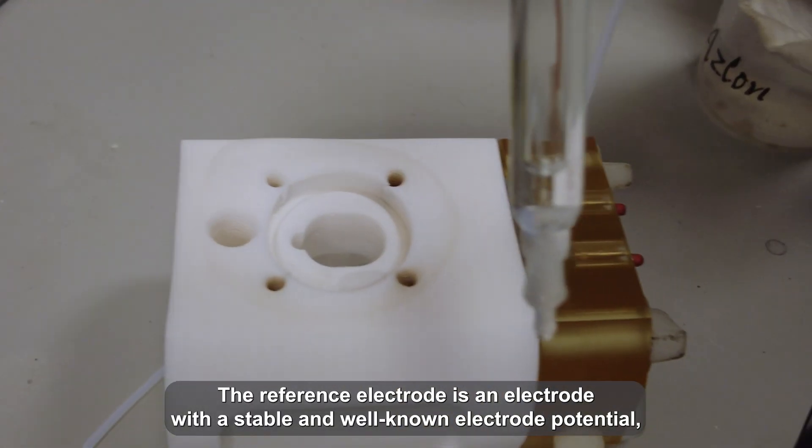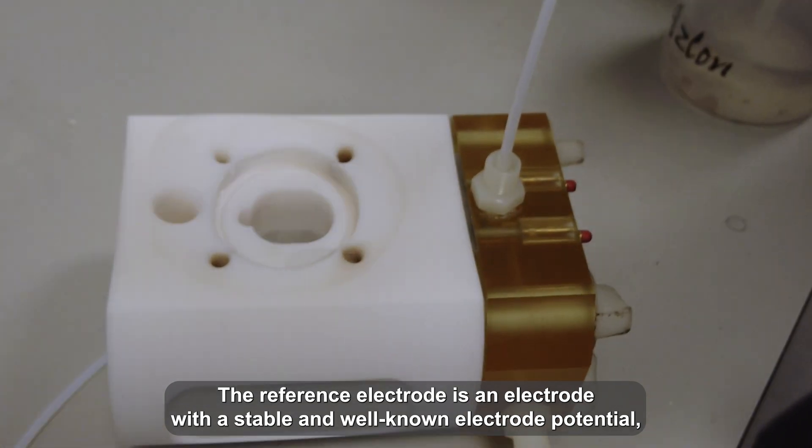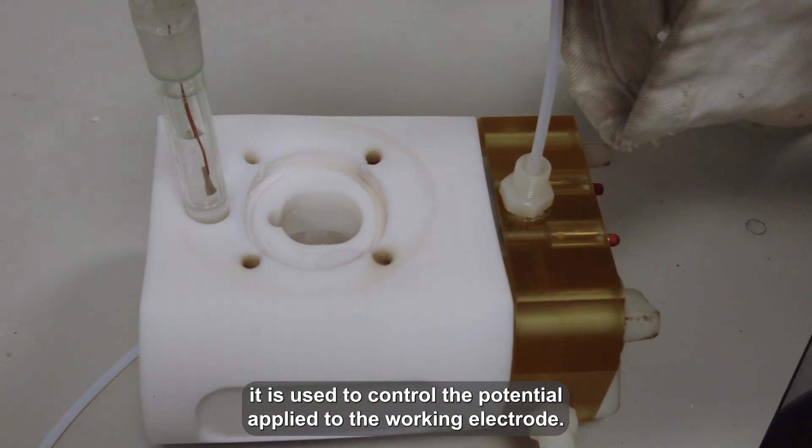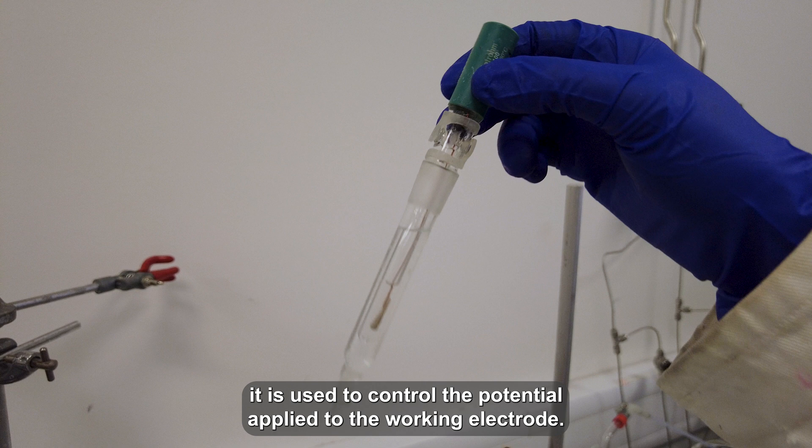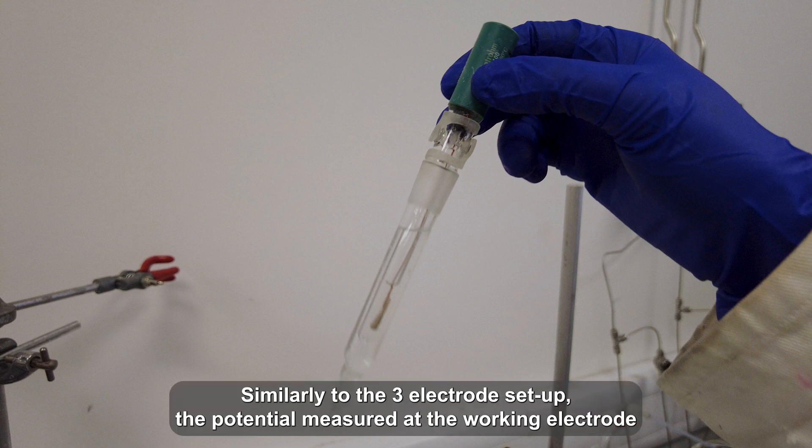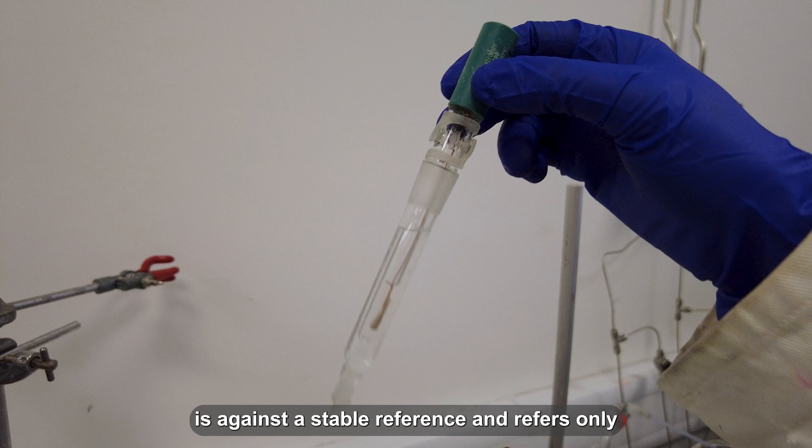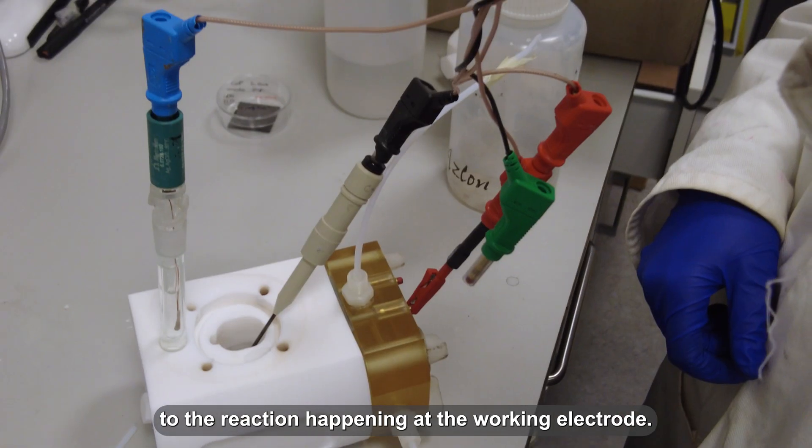The reference electrode is an electrode of stable and well-known electrode potential. It is used to control the potential applied to the working electrode. Similarly to the three-electrode setup, the potential measured at the working electrode is against the stable reference and refers only to the reaction happening at the working electrode.